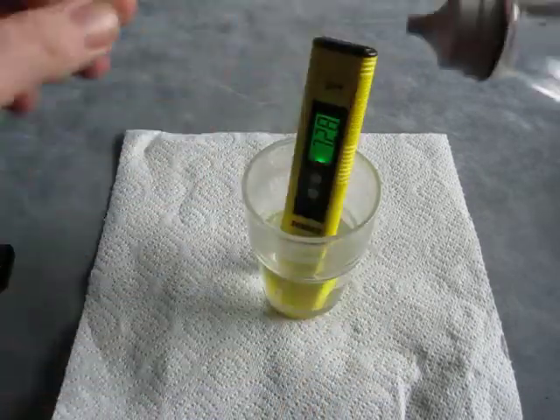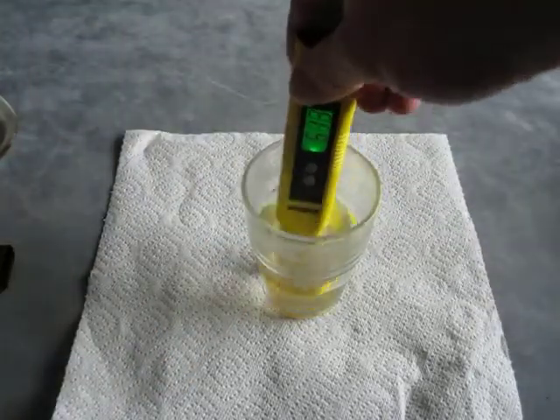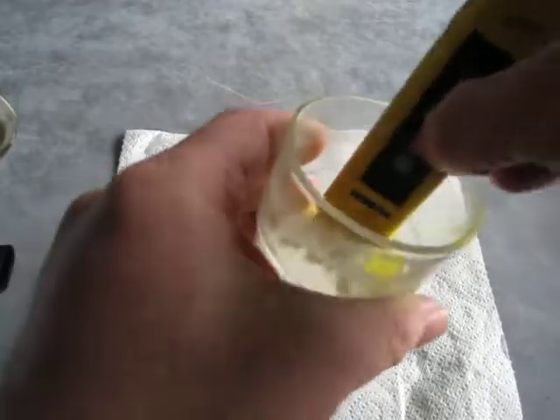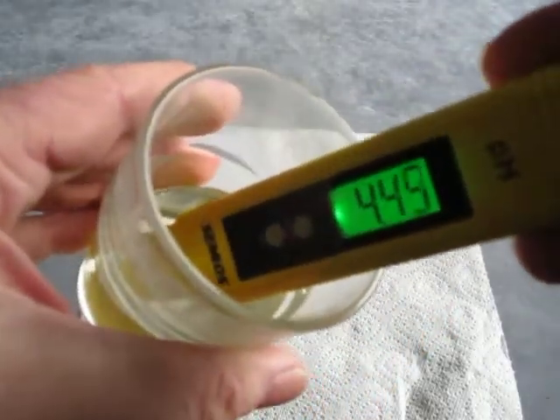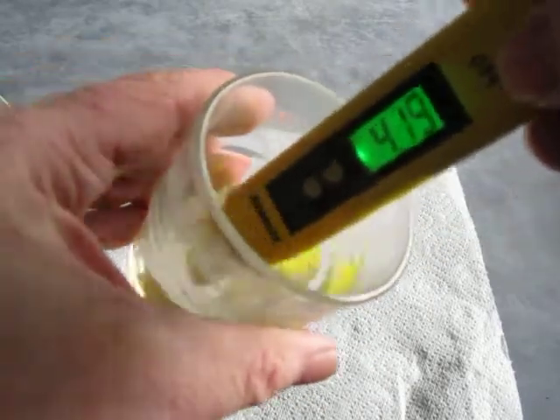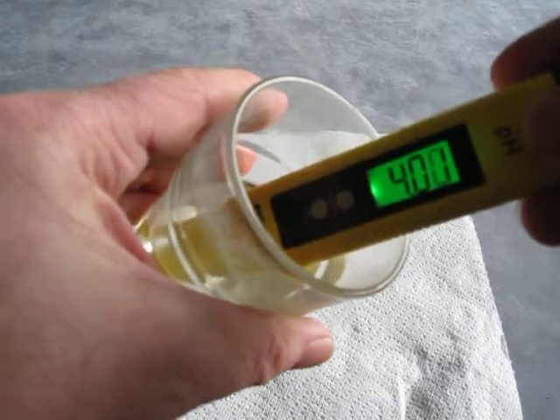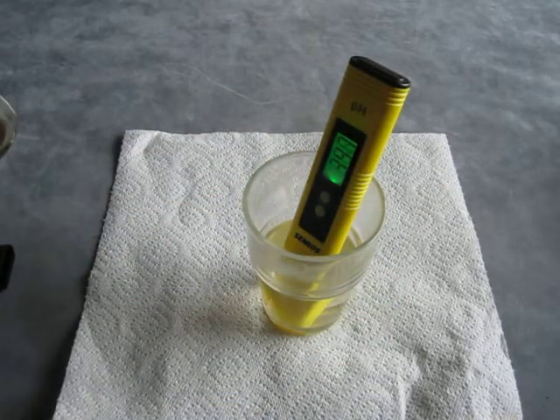Here we've got some vinegar. So there's vinegar in there. You can see that the fluid has changed from a pH of 7 to a pH of 4, so we know that we've gone acidic.